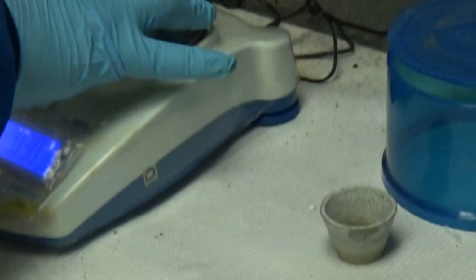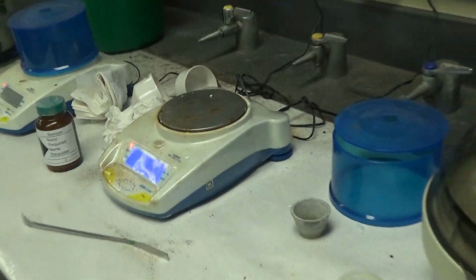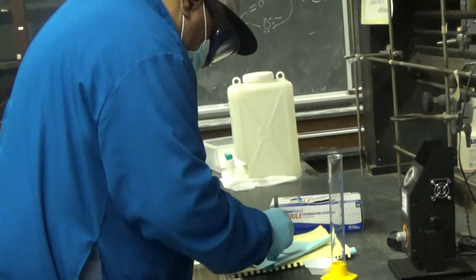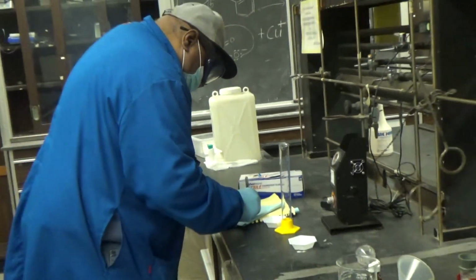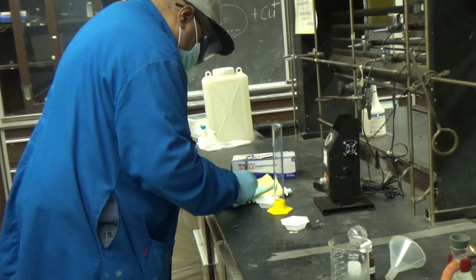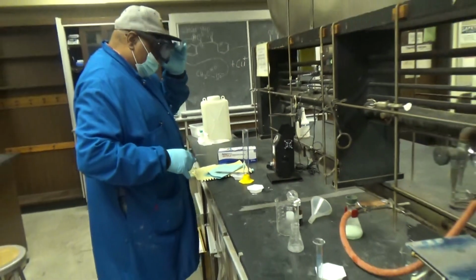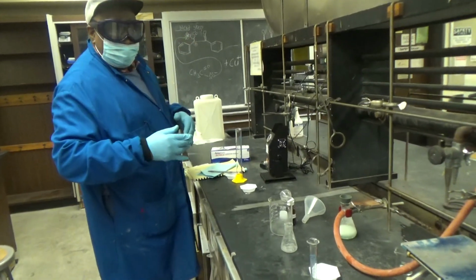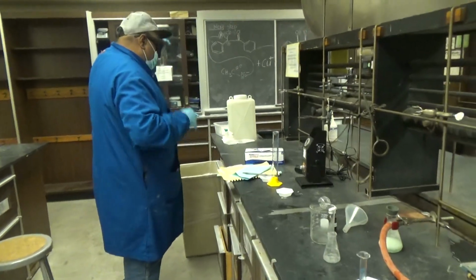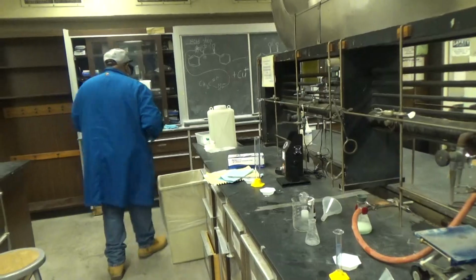Yes. 30% yield or something from the purification step. 0.3 grams. 0.3 grams of purified product. Yeah, which is correct. Good. It has to be less than that. Yeah, if you have more, then you have a problem. Yeah. You can't create matter from no matter.